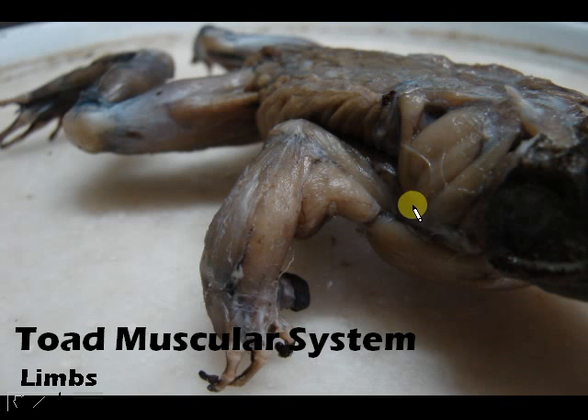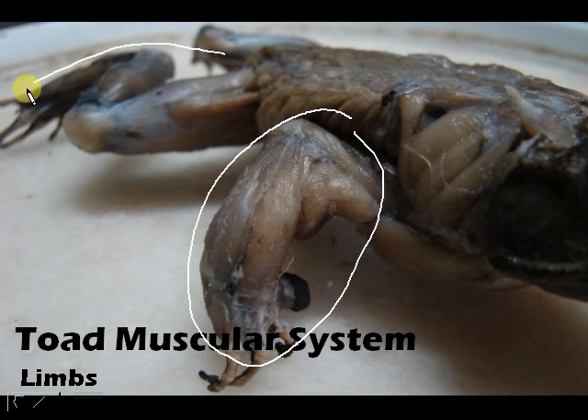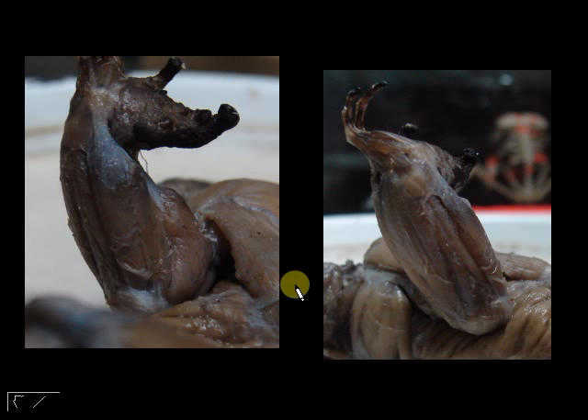Now we will move on to the muscular system for the limbs, which means we will be dealing with the muscles of the forelimbs and the muscles of the hind limbs.